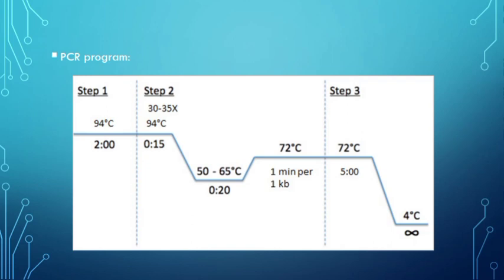Using the PCR is like using your smartphone. PCRs also have different types of screens or features, and you will have to set these things. There are 3 steps. Okay, the first is primary denaturation, which is also variable, 2 to 4 minutes. Step 2 is denaturation of 15 to 30 seconds, or sometimes 1 minute.